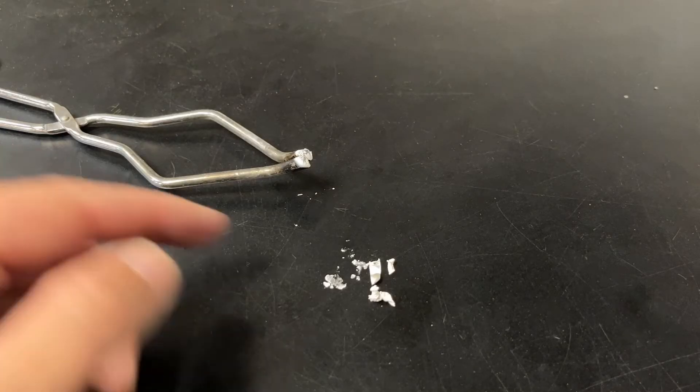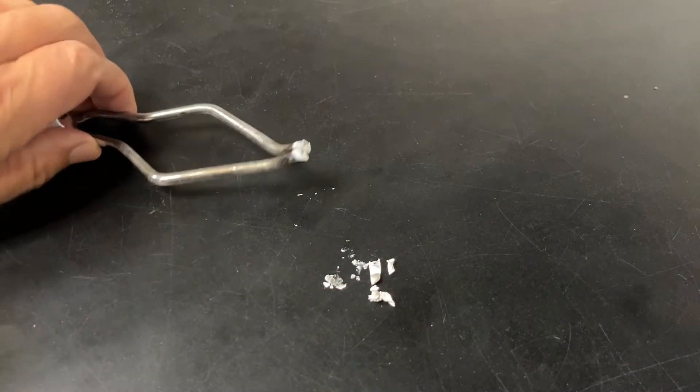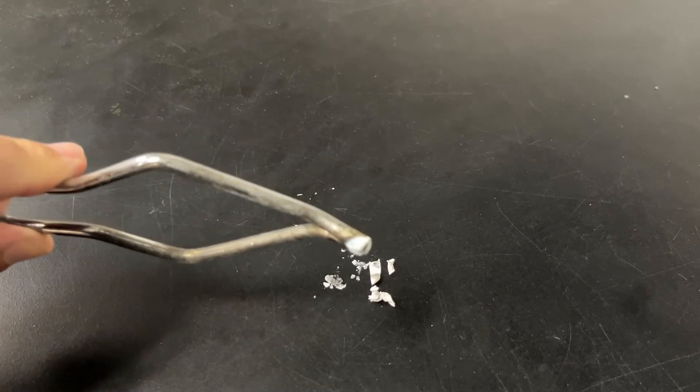And here's all that we have left from burning the magnesium. It turned into instant rust. If you look at the tongs, they have a white coating on them.